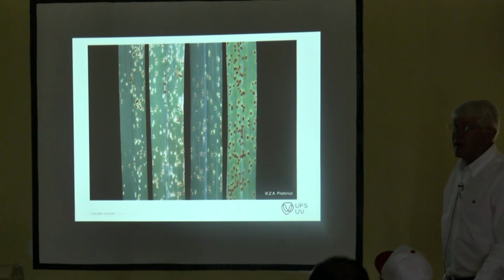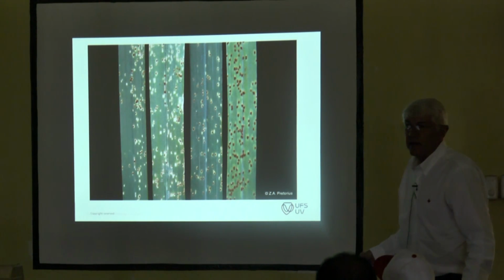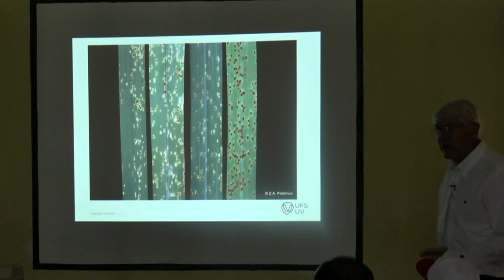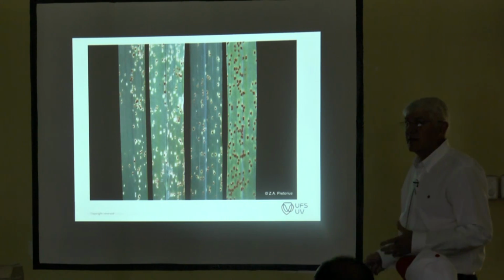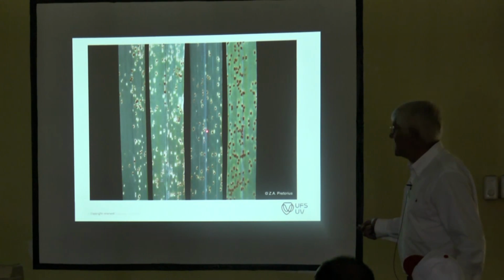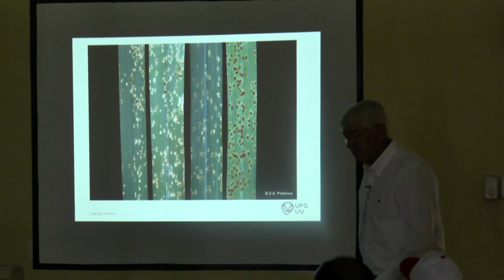These are from flag leaves. Again, it's wheat leaf rust, Puccinia triticina. There's your control, susceptible. And those three, I think quite clearly, they're low. This is the response of LR12, LR13, and LR22A. All three of them are adult plant resistance genes, but single major genes for adult plant resistance. As far as I know, this one has not been conquered. Robert? 22A, no virulence for that, as far as I know.